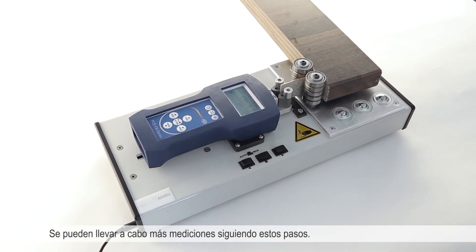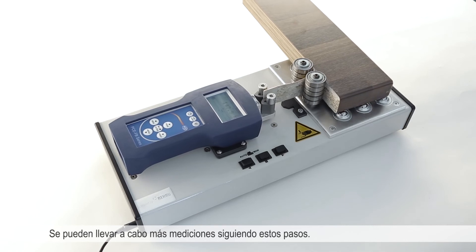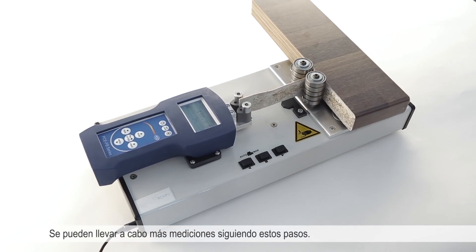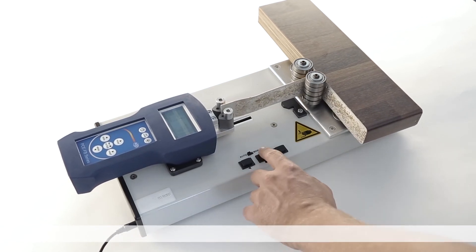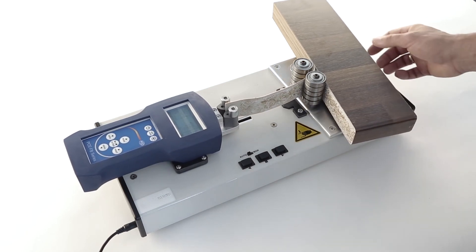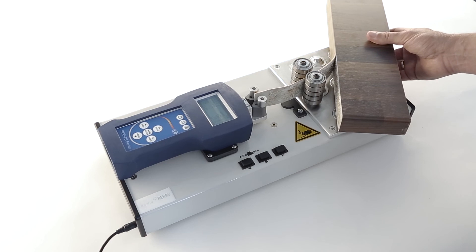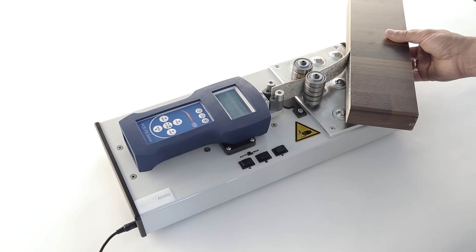The PCE PST1 test stand for peeling tests handles adhesive forces of up to 500 newtons. The measuring edge thickness is from 0.5 to 3.5 millimeters and the measurable plate thickness is from 10 to 64 millimeters. It features a graphic display with a USB interface, automatic and manual mode, and is suitable for mobile use. Results can be evaluated using the included software.